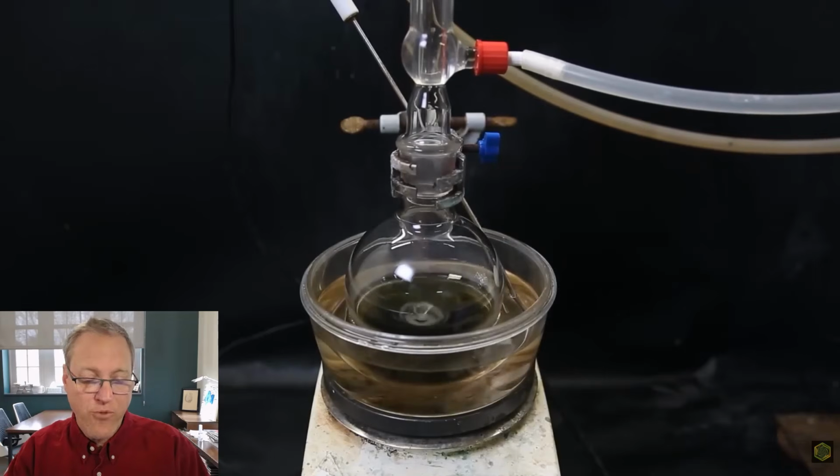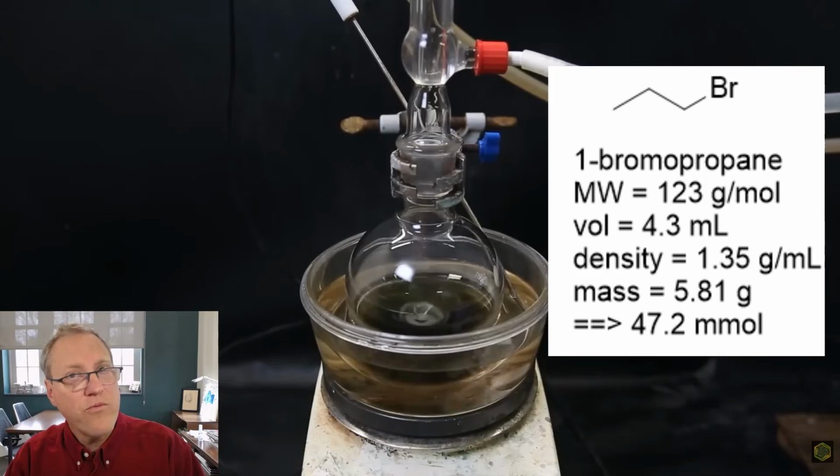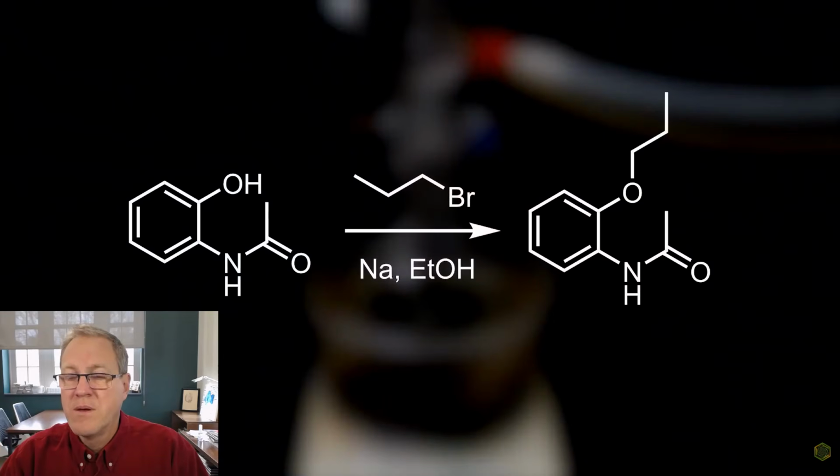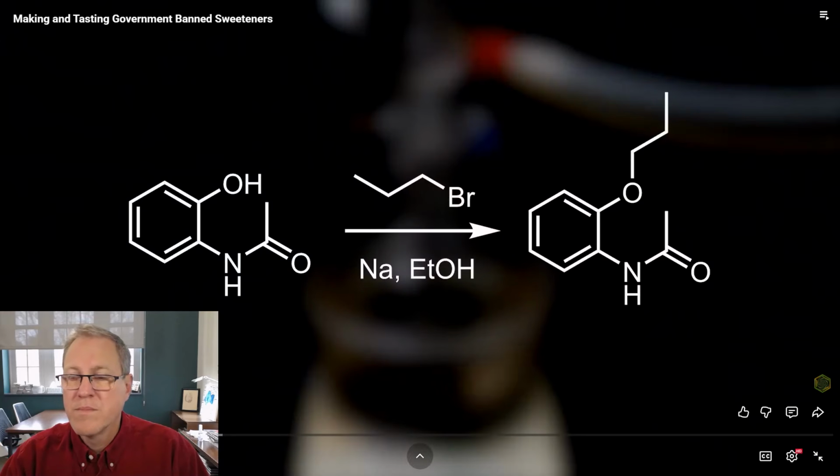It's dripping in. So that was 4.3 milliliters of bromopropane. That is 47.2 millimoles, so about 50. Again, he's adding one equivalent, a 1-to-1 stoichiometry of his reagents, because he just needs one propyl group to make his product. In this reaction, 2-acetaminophenol reacts with 1-bromopropane in the presence of sodium ethoxide to form 2-propoxy acetanilide.